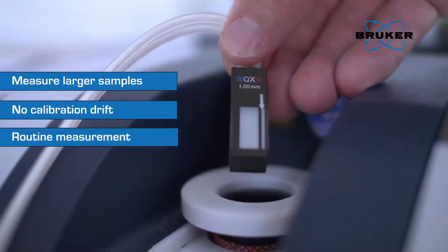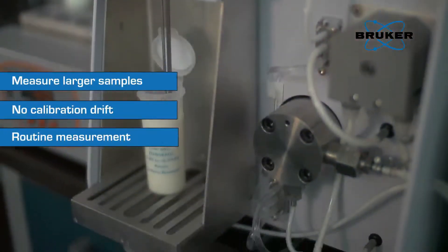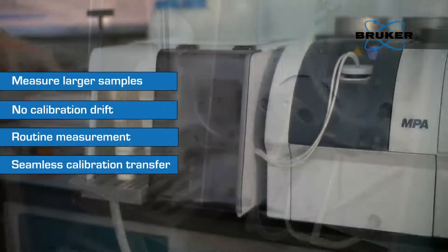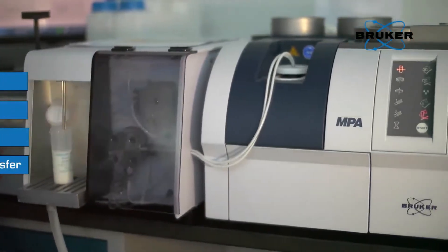Routine measurement of high viscosity samples thanks to larger tube and flow, seamlessly transferring calibrations between different instruments—every instrument is a master.